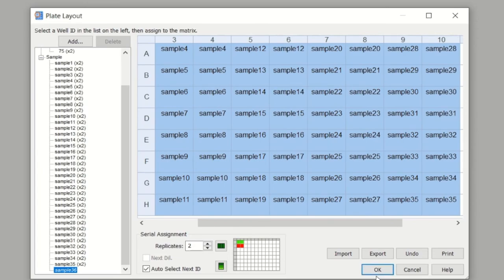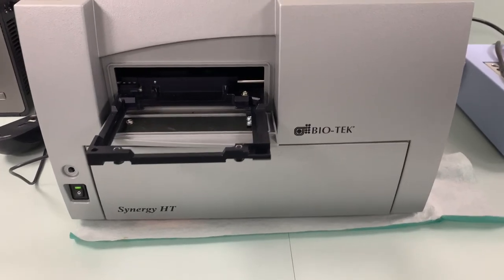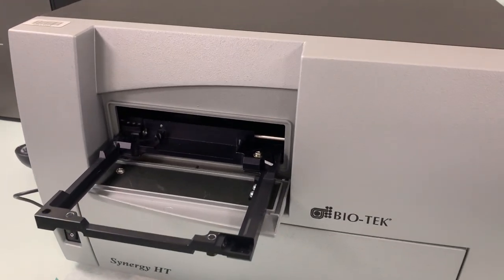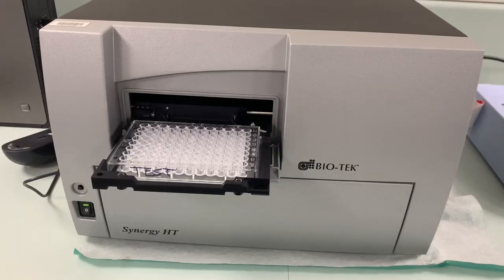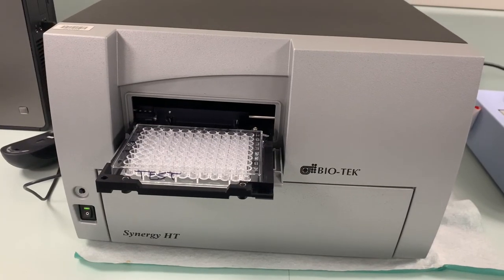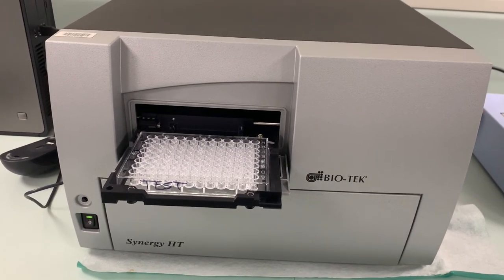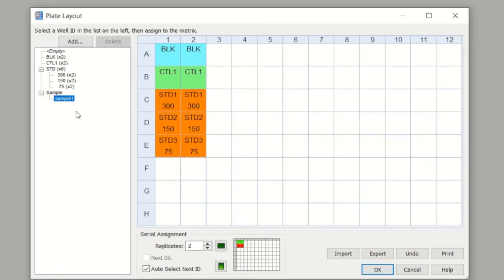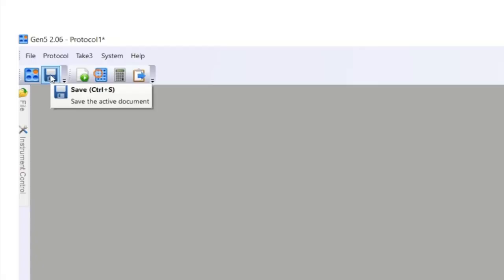Select OK, and now it knows when it goes to read the plate which wells contain a standard, which wells contain a sample, which one has your blank, your control, and your sample control. Don't forget to save your procedure. Go ahead and select Save and name it appropriately.